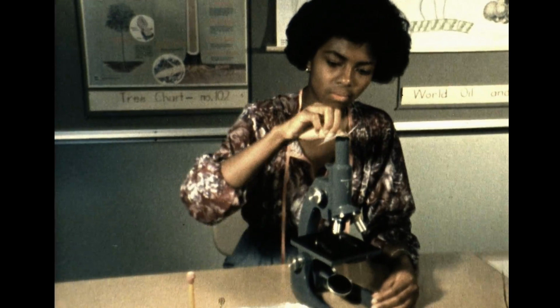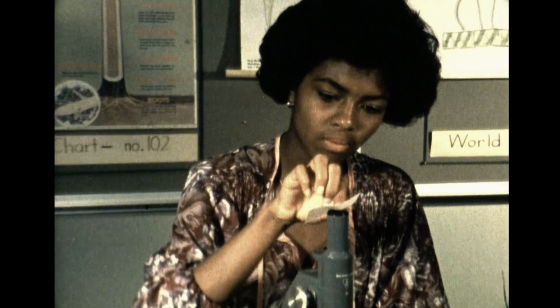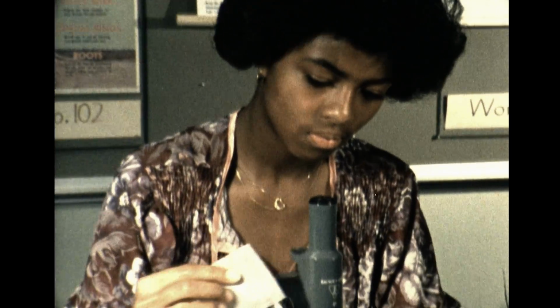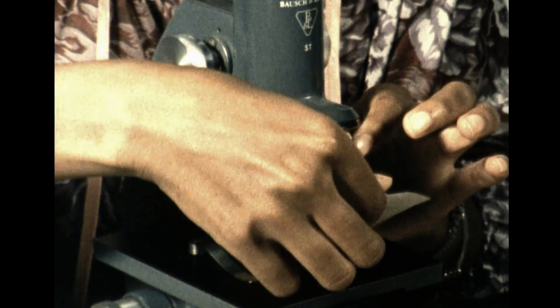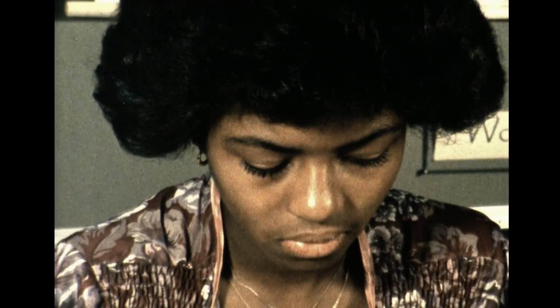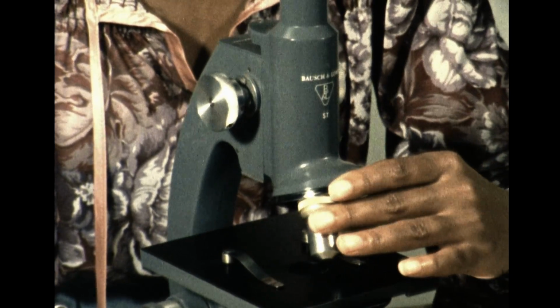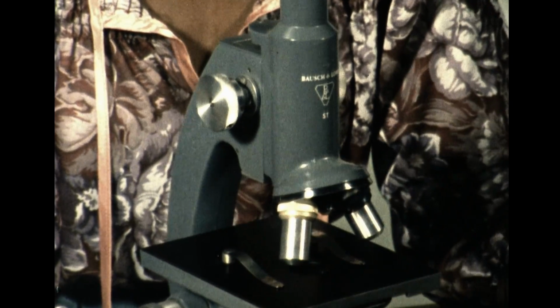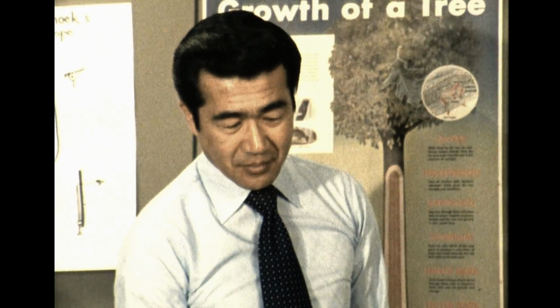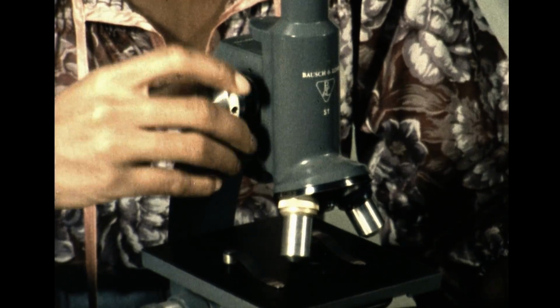2. Clean the lenses of the eyepiece and the objectives. Use only soft lens paper, the sort of paper used for cleaning eyeglasses. 3. Put the turret into neutral. Neither the low nor high power objectives are in viewing position. 4. Raise the lens systems all the way.